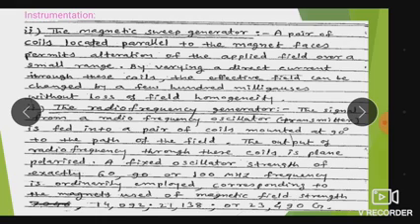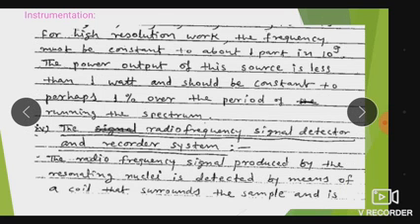The output of the radio frequency through their coils is plane polarized. You will get the plane polarized output. A fixed oscillator frequency of exactly 60, 90 and 100 megahertz is ordinarily employed, corresponding to magnetic field strengths of about 14,092 gauss, 21,138 gauss, or 23,490 gauss. So for high resolution work, the frequency must be constant to about 1 part in 10 to the power 9.